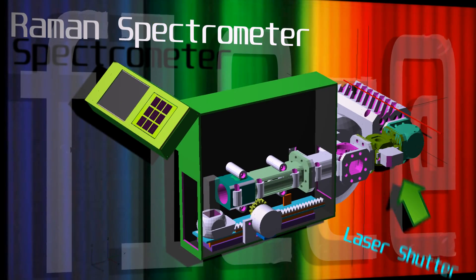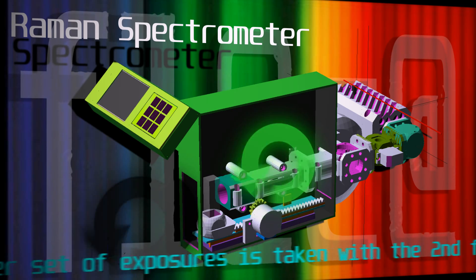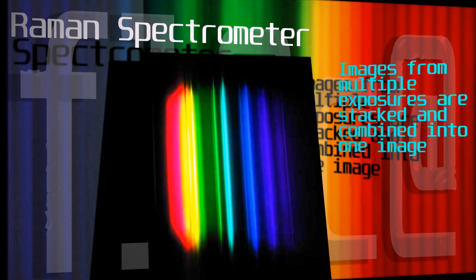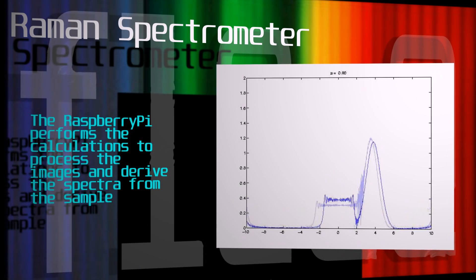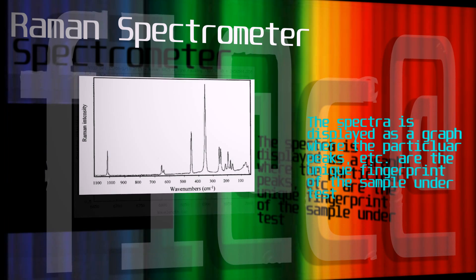The shutter is then re-engaged, the second filter is selected, and the process repeats. The spectrometer then does some image stacking, combining the multiple exposures into one image. It then performs Fourier transforms and derives its spectra of the sample.